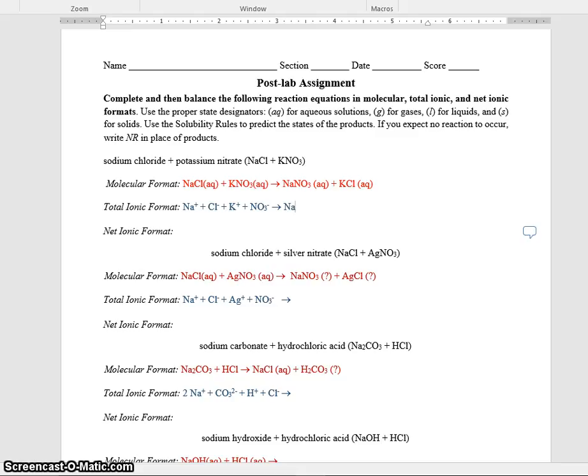We have Na plus, whoops, that didn't work so great, did it? Hold on one second.